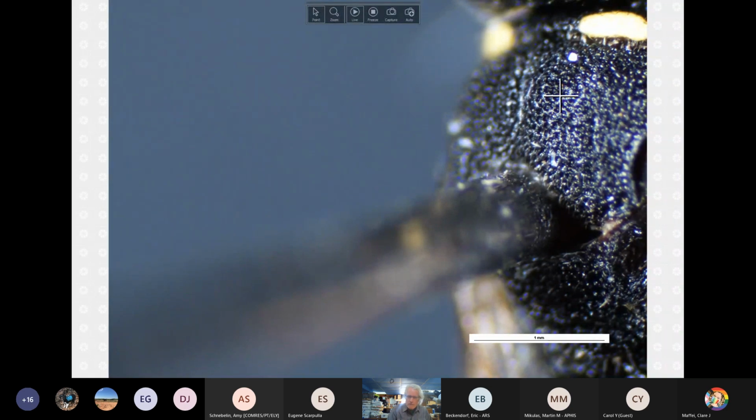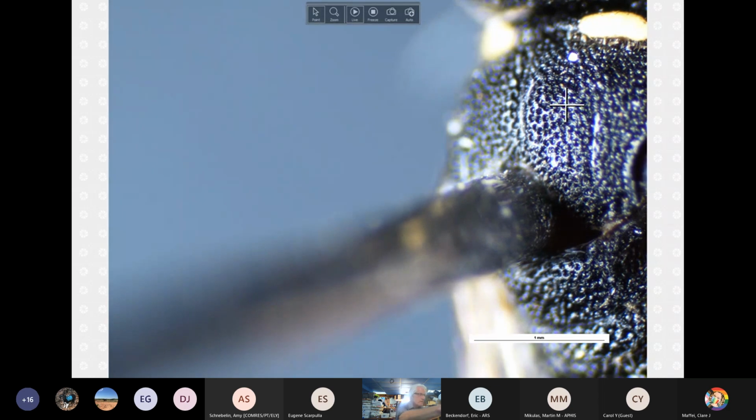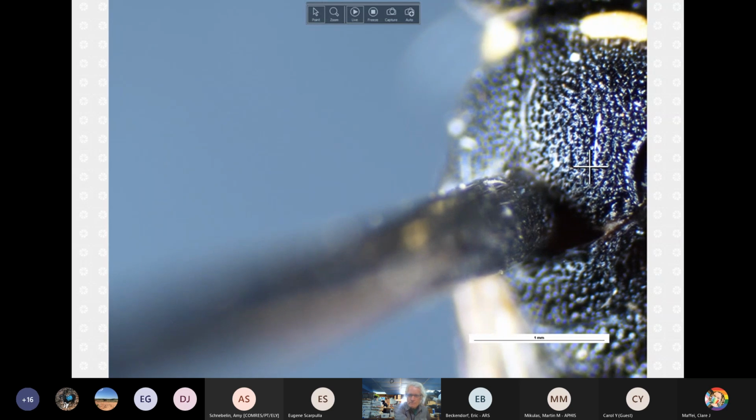that combination, large size, overlapping pits, and surface topography, sets it into a group of specimens such as Schwartzii, ornatus, nelumbonis, and I think this one in Florida whose name I can't recall, that sometimes I think is just a black ornatus too, compared to the parapsidal line.